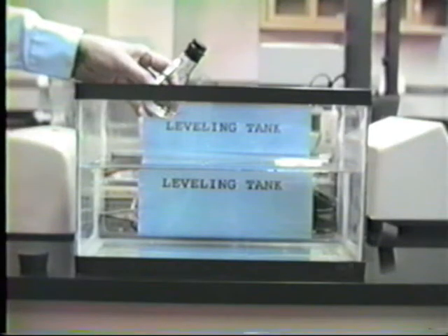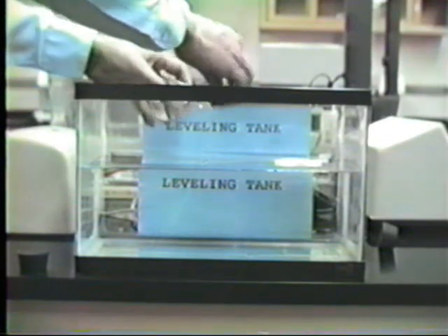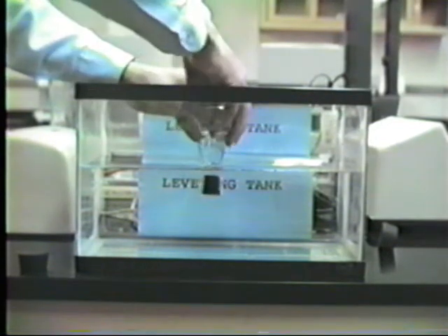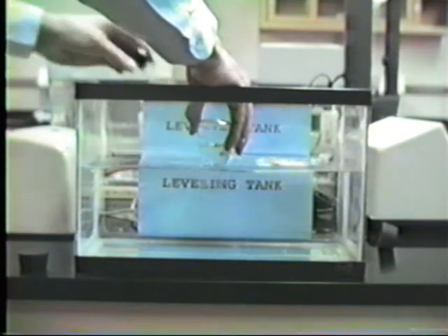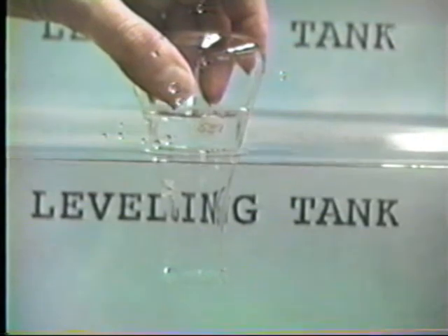Having collected your oxygen, you will now go to the leveling tank to bring the pressure of the gas inside your flask to atmospheric pressure. We have our flask still tightly stoppered. What we must do at this point then is to put it underwater. We stoppered it underwater and we must unstopper it underwater, and we take out the stopper upside down so that the mouth of the flask is underwater, therefore no gas escapes. As I am holding the flask, the pressure inside the flask is less than atmospheric pressure.